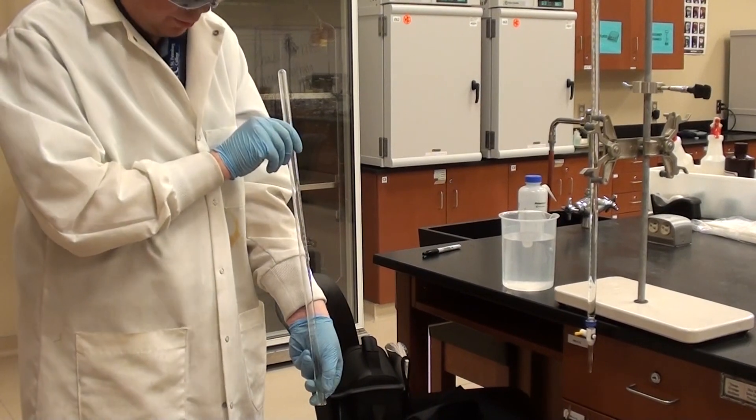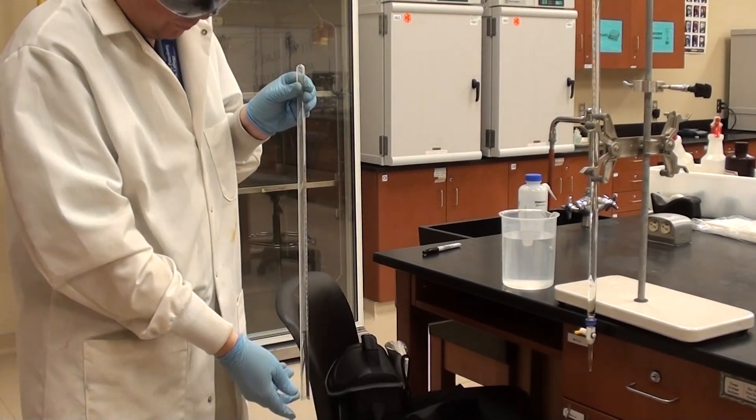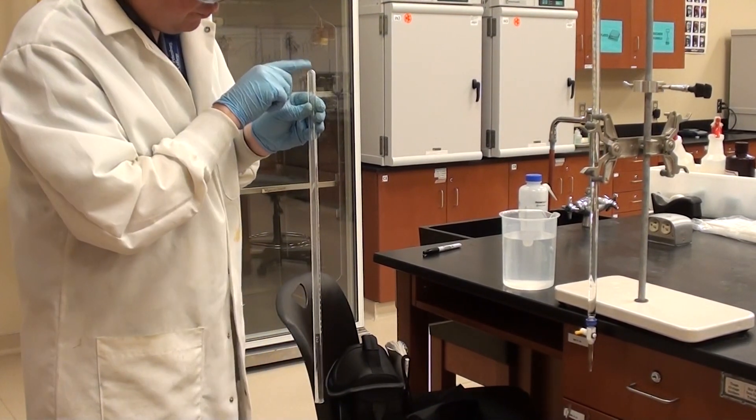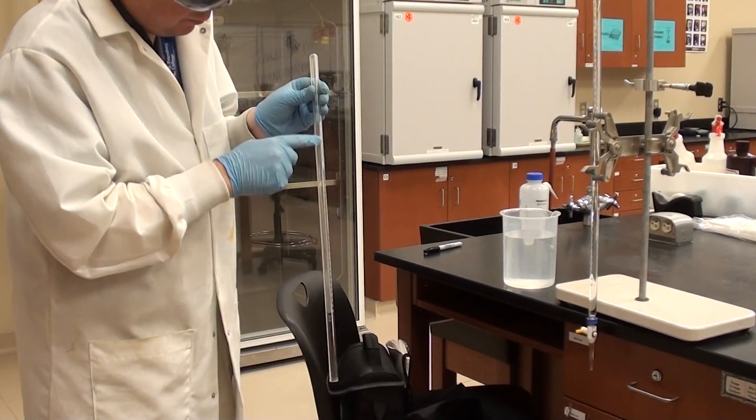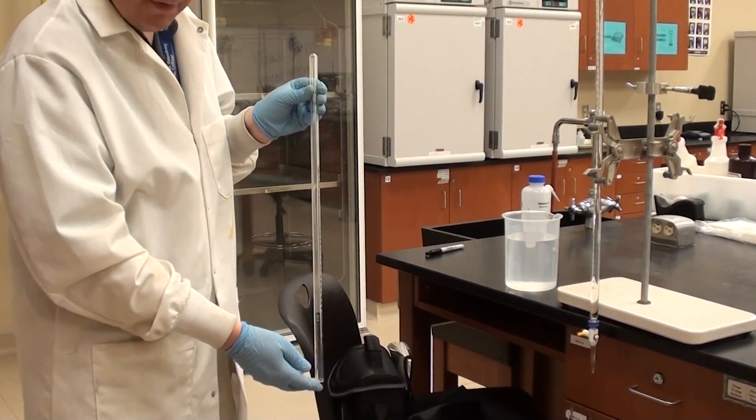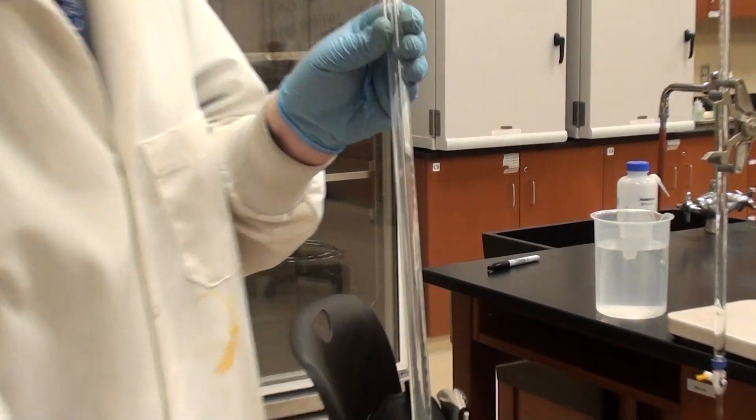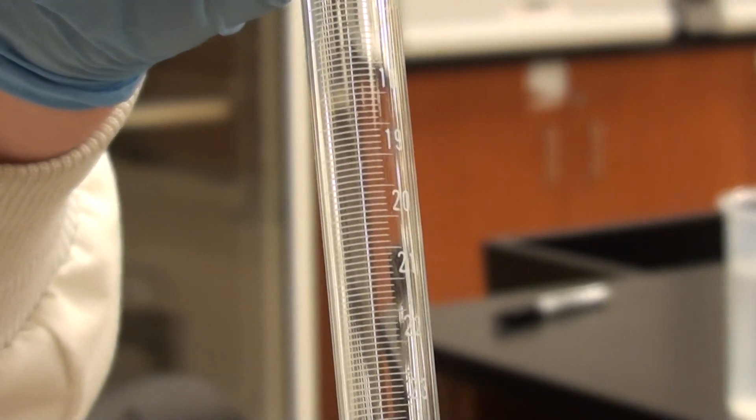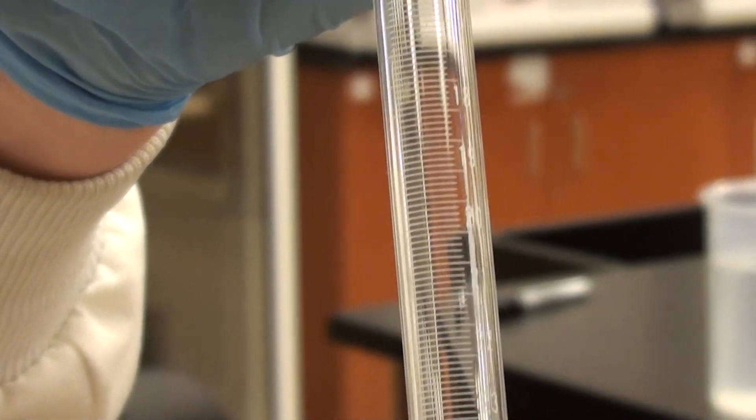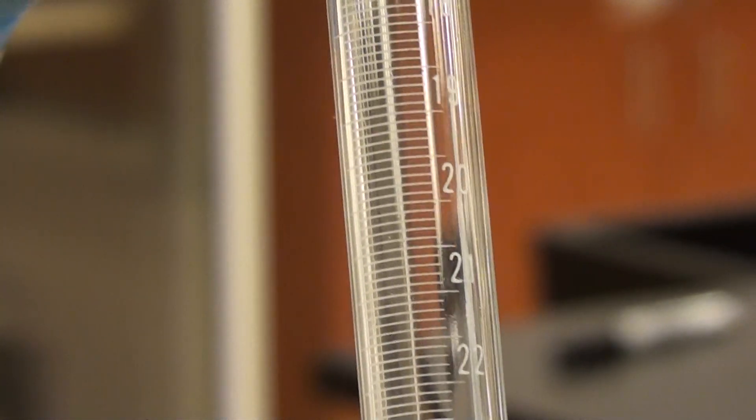So what we're looking at here is what's called a eudiometer tube. It's closed at one end and open at the other end, and it's got these little graduations on here. I'm going to move this in closer to the camera so you can get a closer view of what the graduations look like. Now the unfortunate thing about a eudiometer tube is you would hope that the graduations were accurate and that they were exactly one milliliter, but unfortunately it turns out that they're not.